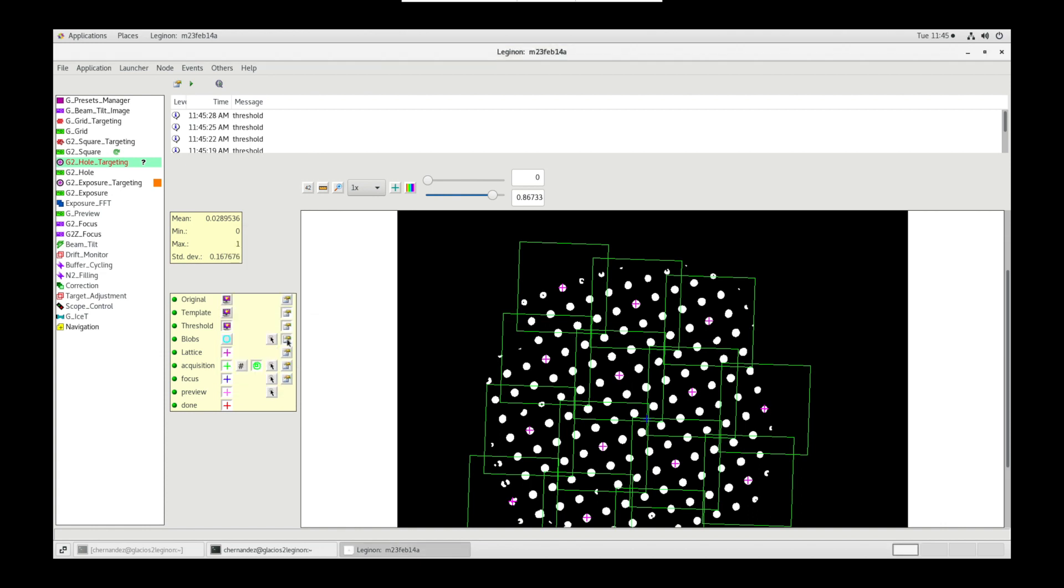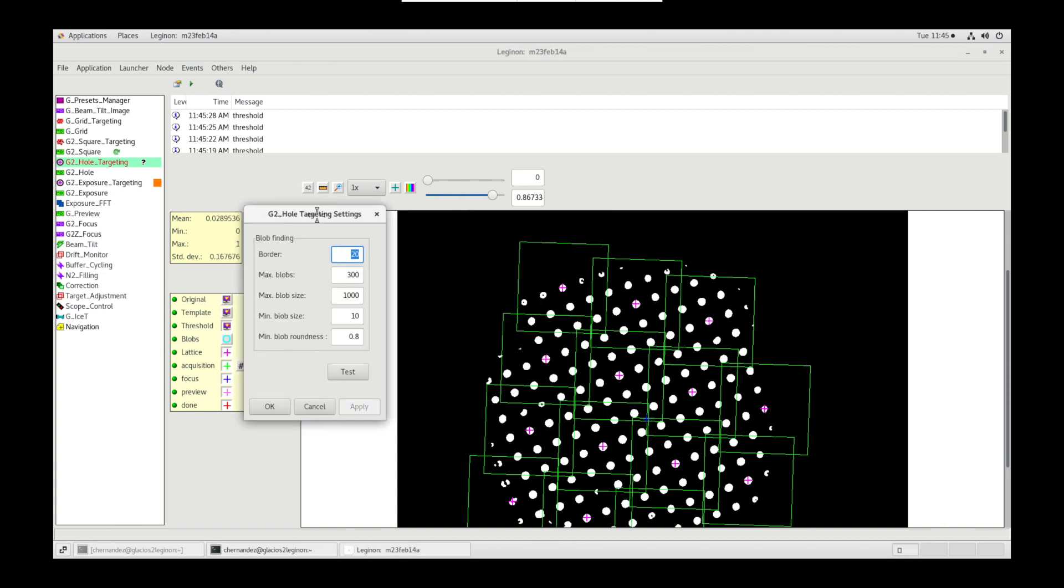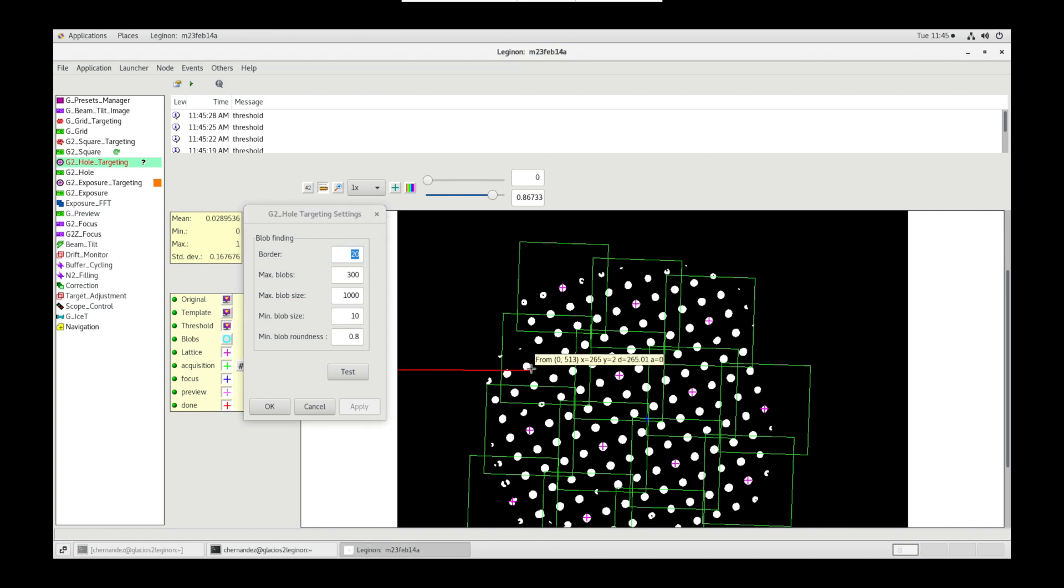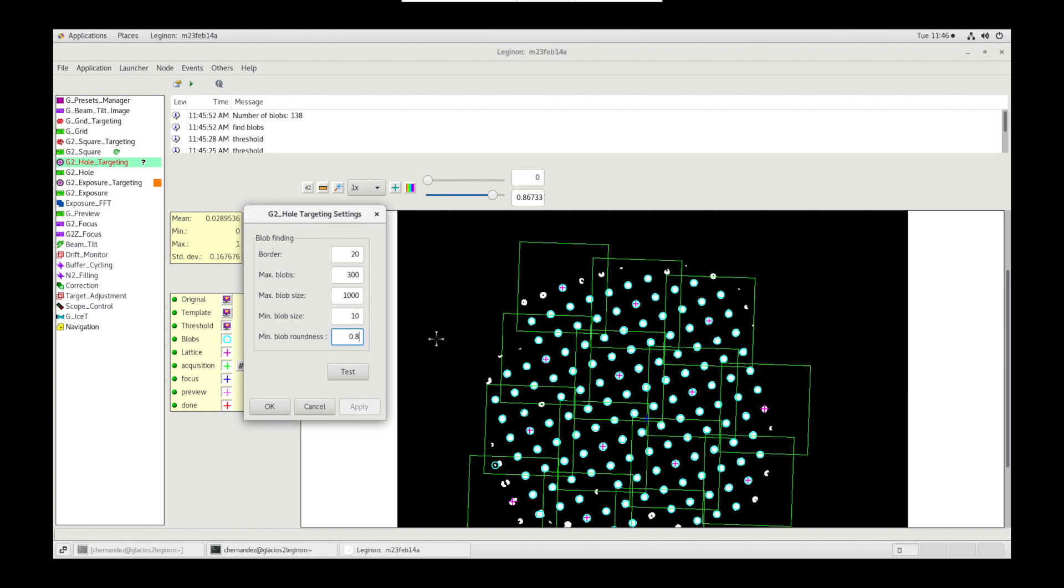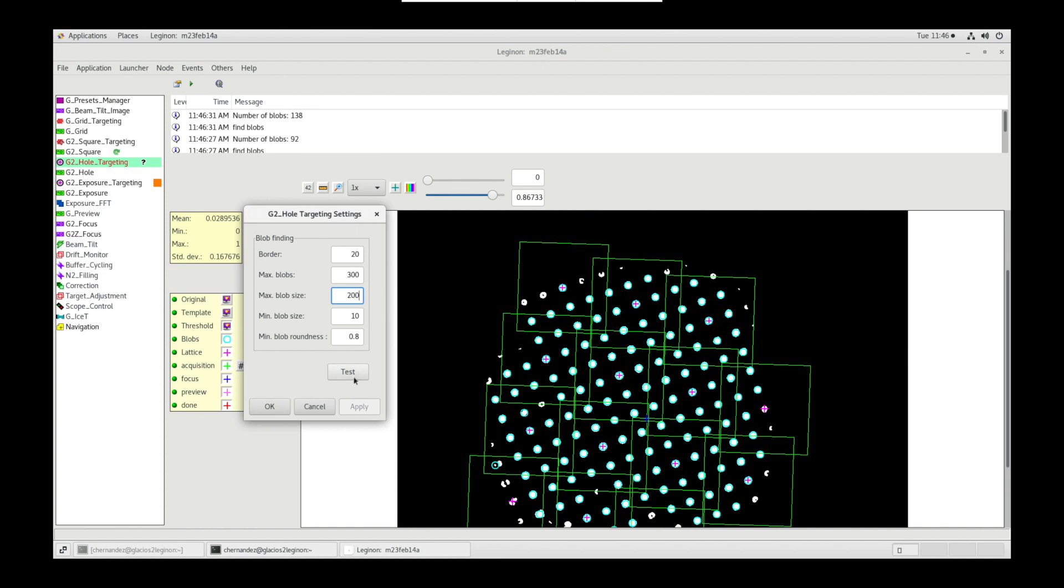In blob settings, border allows you to exclude blobs at the edges by measuring the distance you want to remove. Min blob roundness value of 0.8 selects more rounded blobs. Lowering this number decreases preference for roundness. We can include and exclude blobs based on their size. Hovering over blobs will give you size values. You can change min and max blob size to threshold to our liking. We can also select how many blobs we want to keep with max blobs. And satisfied, click OK.